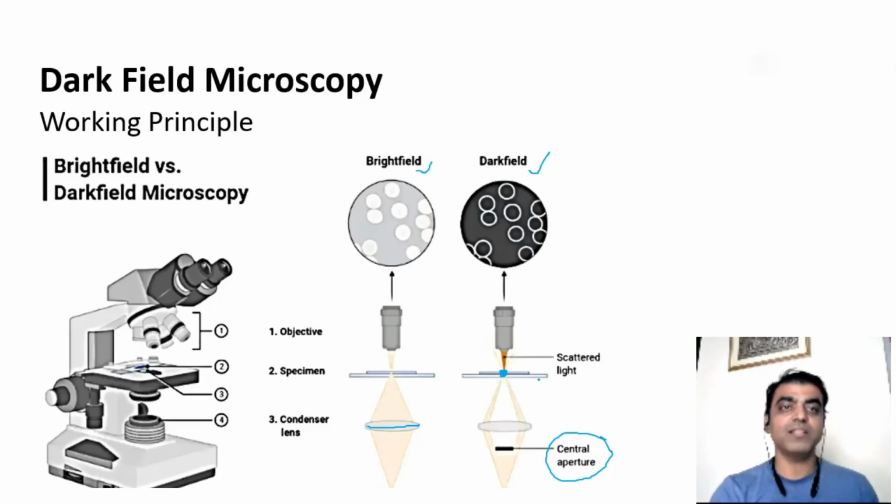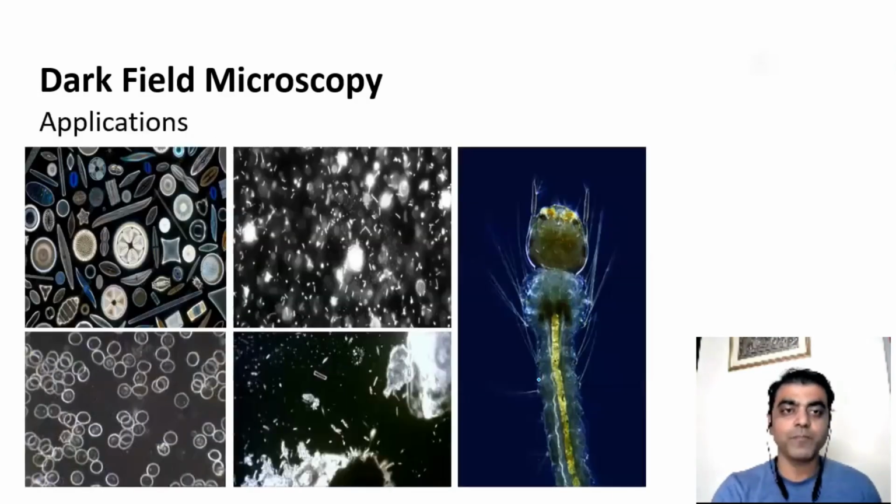So apart from that, there is no difference. It is basically the same light path. Okay, now what are the applications of dark field, why are we using it, and how do we capitalize on this technique to get a benefit out of it.